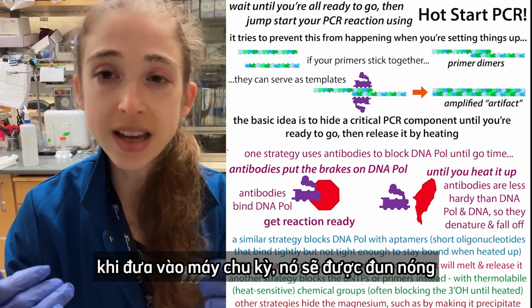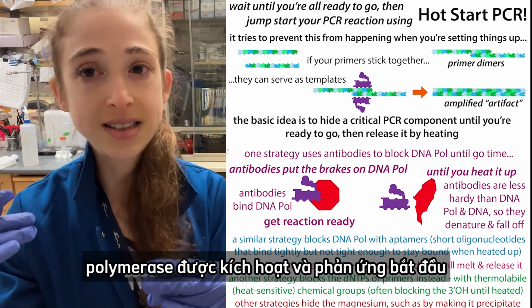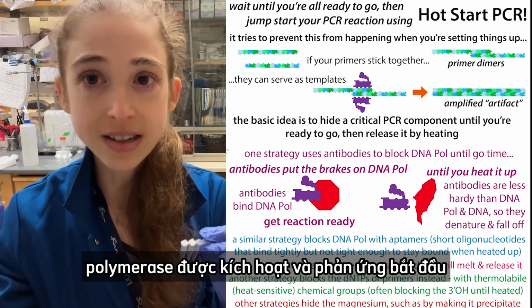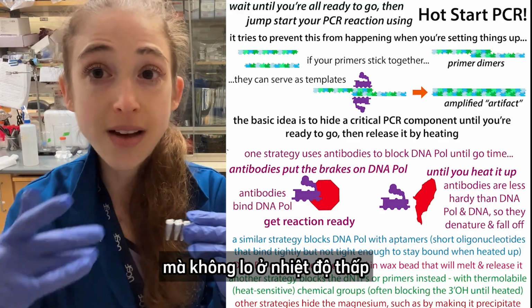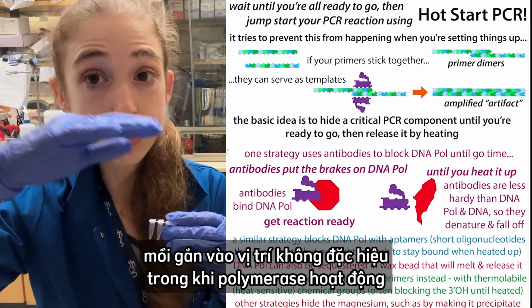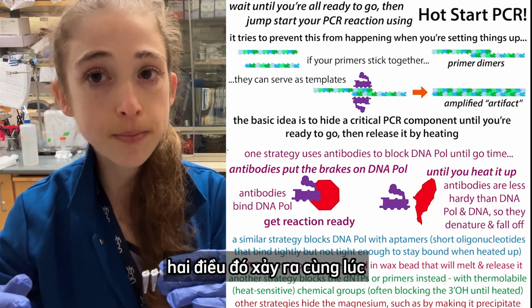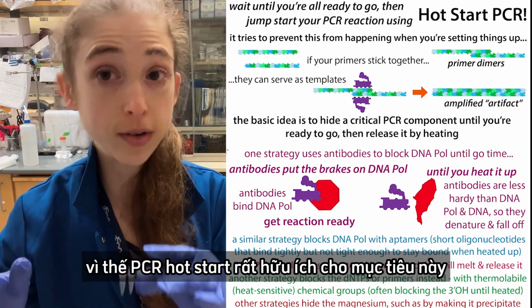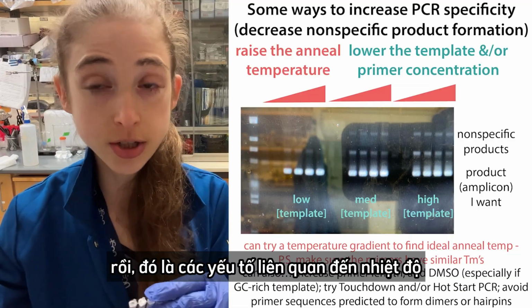When you stick it into the cycler, now it heats up. Now the polymerase becomes activated, and you can get your products going, but you don't have to worry about having those lower temperatures where you have the primers binding to non-specific sites and the polymerase being active at the same time. So hot start PCR is really helpful for that.